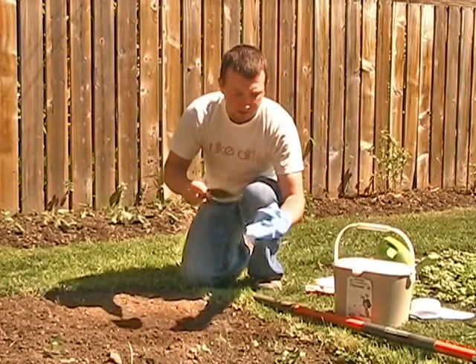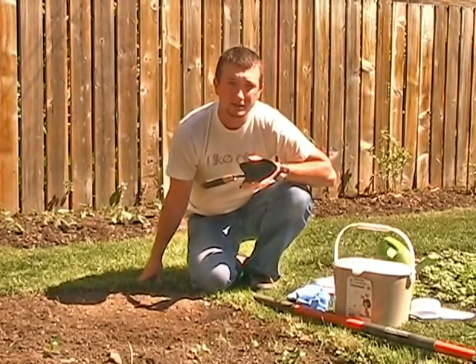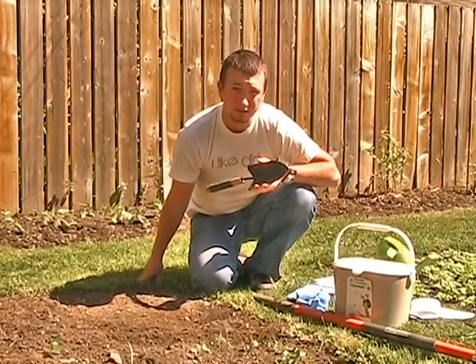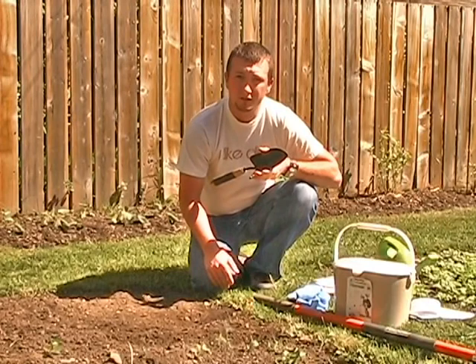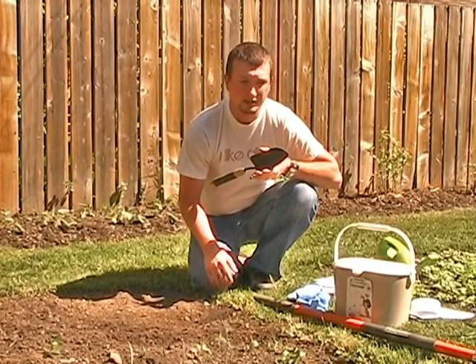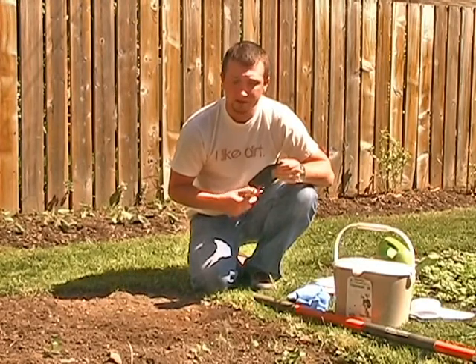The other thing I should mention is you want to make sure your shovels are made of the right material — not galvanized steel, which is zinc-plated, because that's going to throw off your zinc results if you're doing any micronutrient testing for copper, iron, manganese, and zinc. So you want to make sure you're not using galvanized steel.